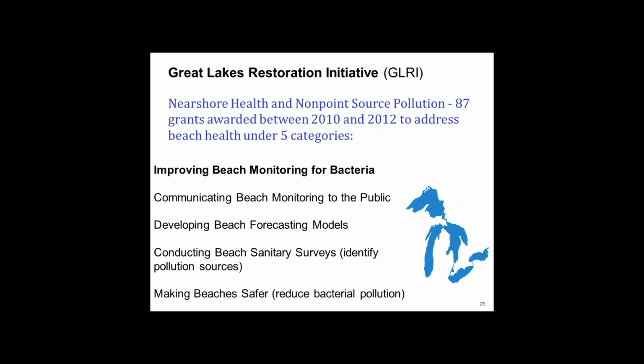So under the Improving Beach Monitoring for Bacteria projects, some entities would validate rapid methods, QPCR, IMS-ATP, which you'll hear about later, and they are able to test water quality conditions in 4 to 6 hours rather than the culture method, which takes 18 to 24 hours to come up with results, which obviously is a problem. If you close a beach when the problem is passed, or worse yet, if you leave a beach open when a problem may be, you may be exposing your swimmers to pathogens.